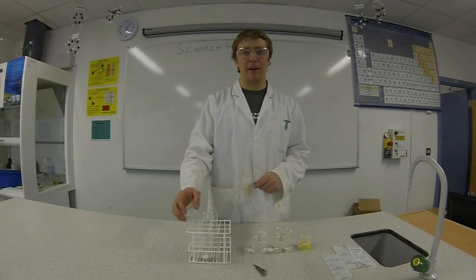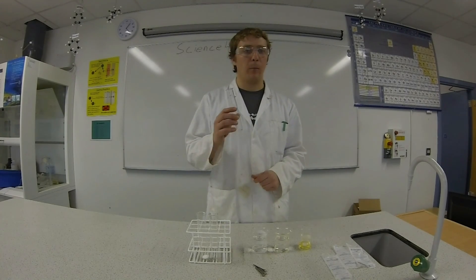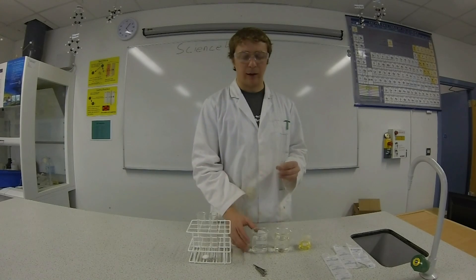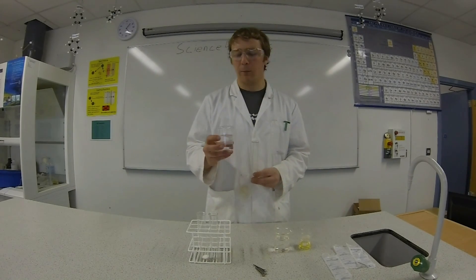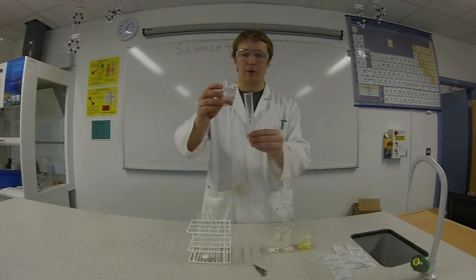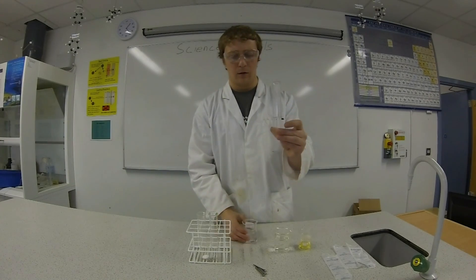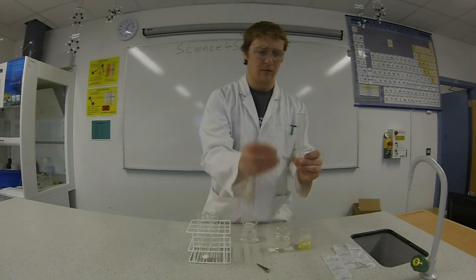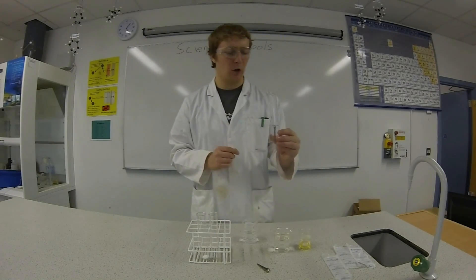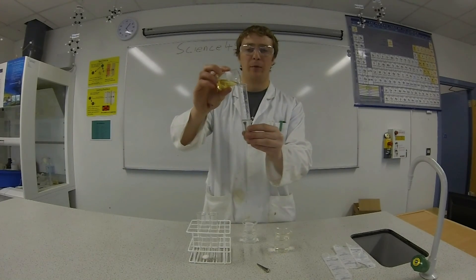So in the first test tube, we're going to have water but we're not going to have oxygen, so that's going to be our boiled cooled water. When you boil water, it loses all the oxygen in it, so this water has no oxygen. Going to add in our nail, and then to make sure no extra oxygen gets in, I'm going to put some oil on top to seal it in.